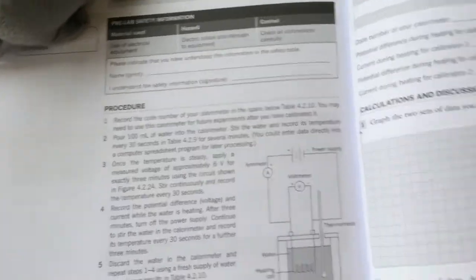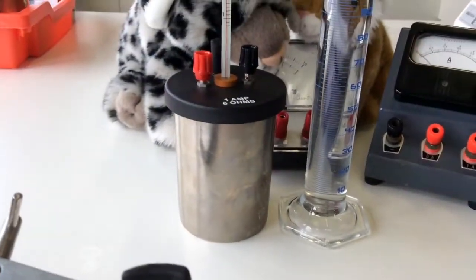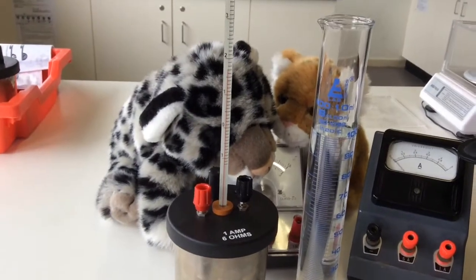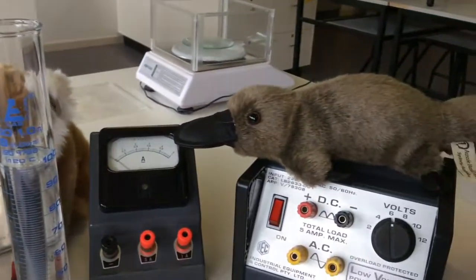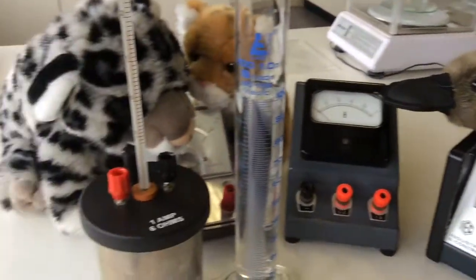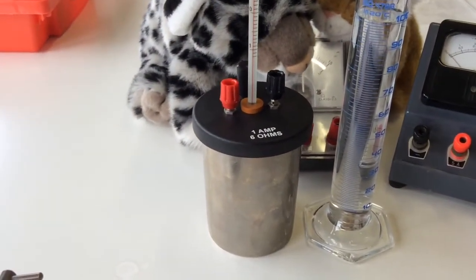I'm just going to use this one that I've set up. And you might be able to see Snowy the snow leopard, Tilly the tiger, and we've got Penny the platypus are helping out today. So this calorimeter is number one.